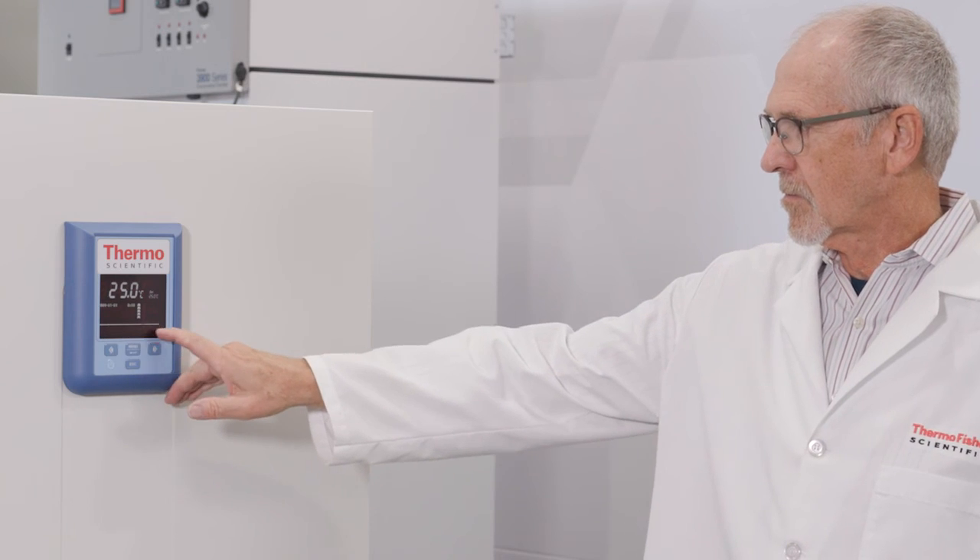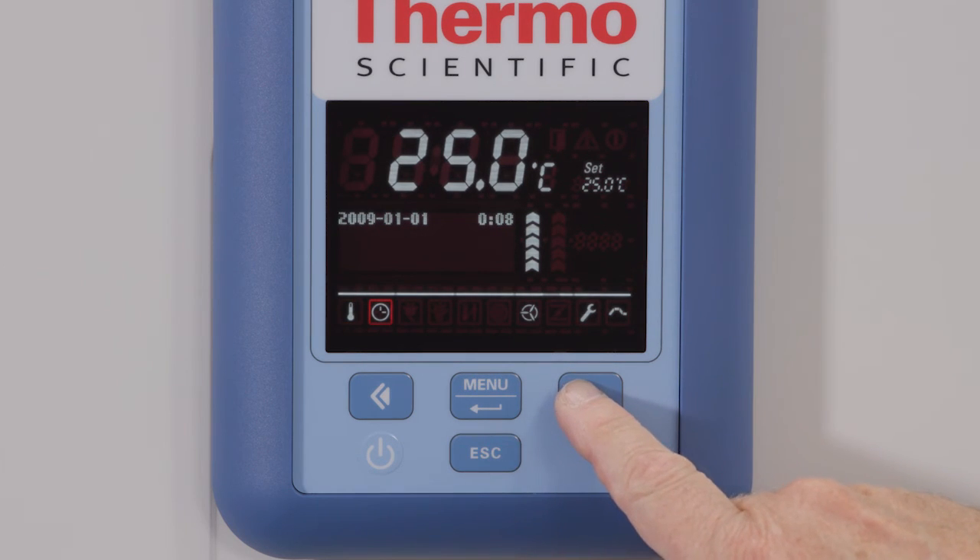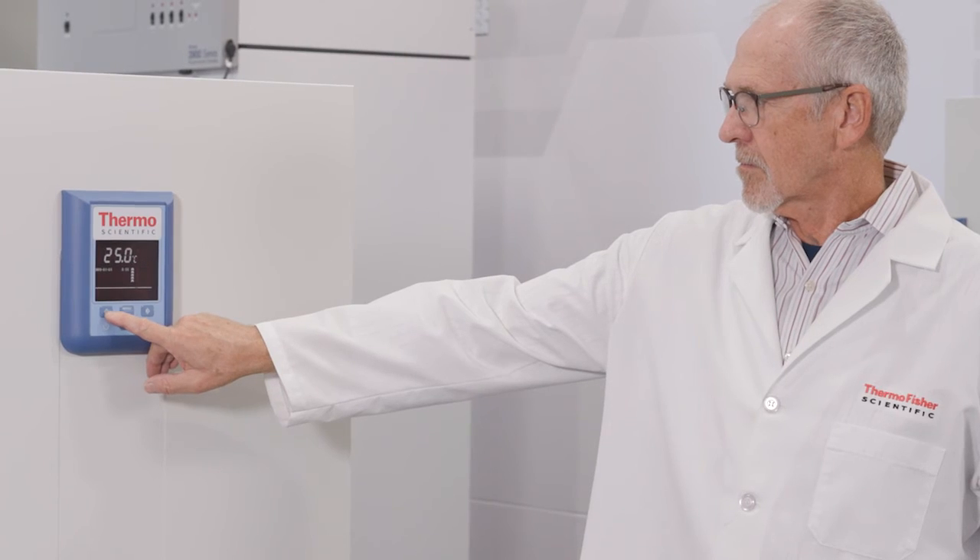Below the display field is the menu bar, which is populated by icons. From left to right, the icons indicate set temperature, set timer, fan status, and settings.